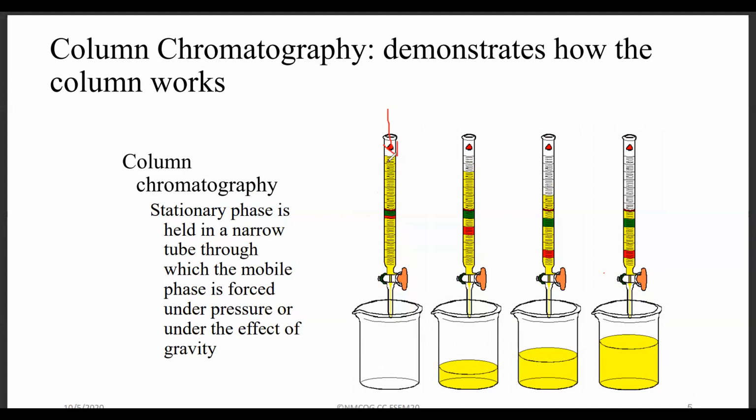So just imagine we have something packed inside, and then we have our mobile phase in between. So our mobile phase is slowly moving through.